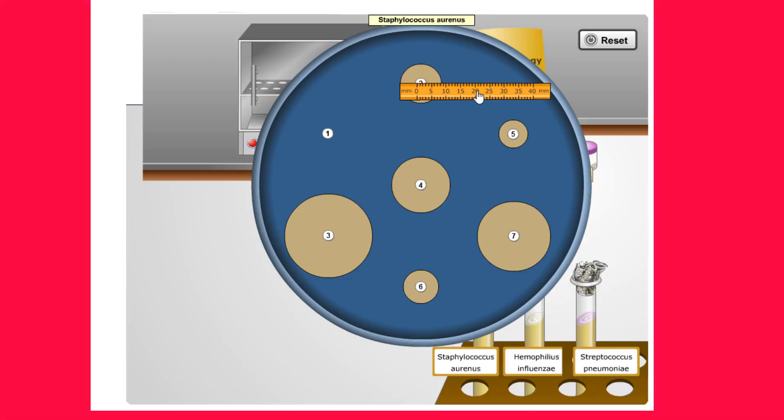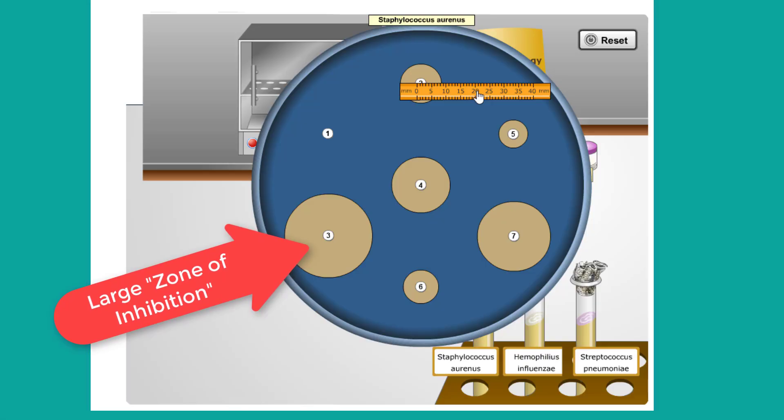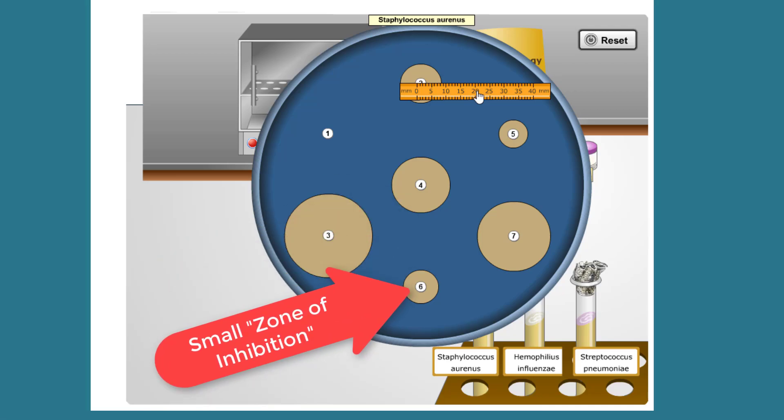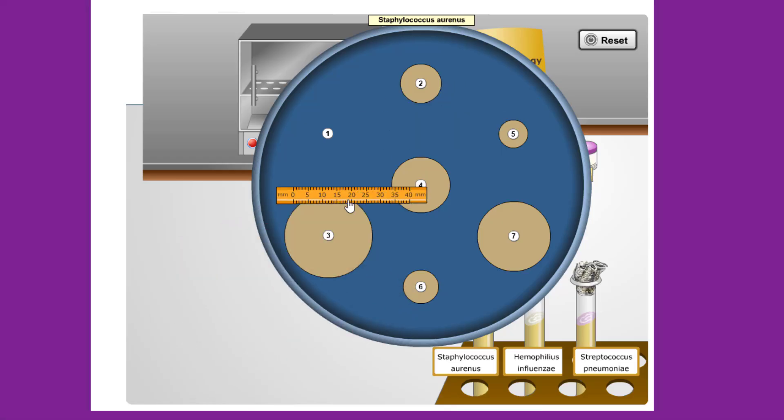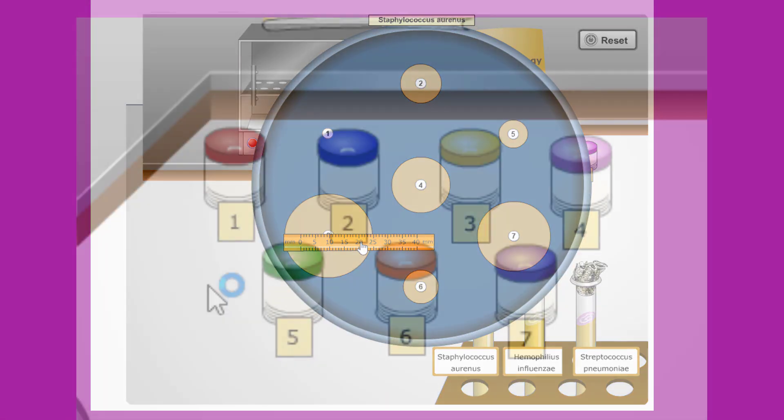We will use our ruler to measure the diameter of the zones of inhibition around each disc. These are seen as the tan areas. Some discs may be surrounded by a large zone of inhibition where no bacteria grew due to strong inhibitory effect of the antibiotic, antiseptic, or disinfectant on the disc. Other discs may have caused little or no inhibition. This means that the bacteria are partially or completely resistant to the antimicrobial agent that is put upon them.